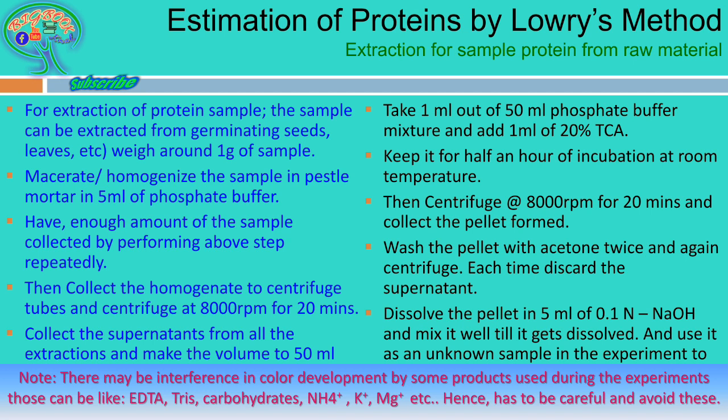Here in the labs during the experiments, there will be different proteins which are already present, ready-made proteins given to the students as unknown samples to estimate the amount of protein within them, particularly with the Lowry's method. So in some labs or in higher studies, you may get this kind of situation or lab experiment where you are going to take this as one of the first steps within the procedure.